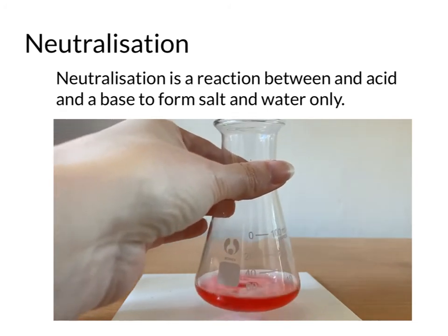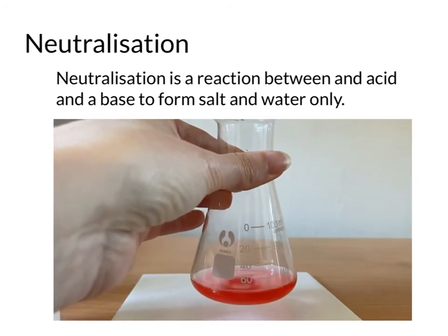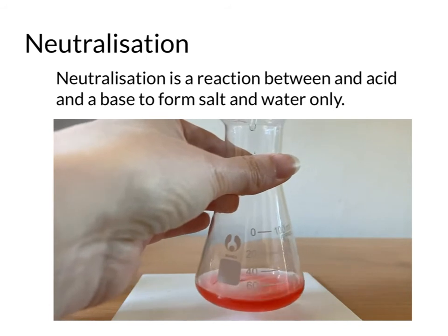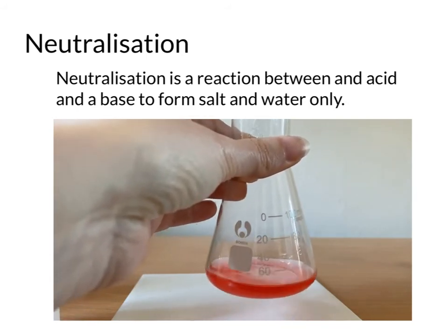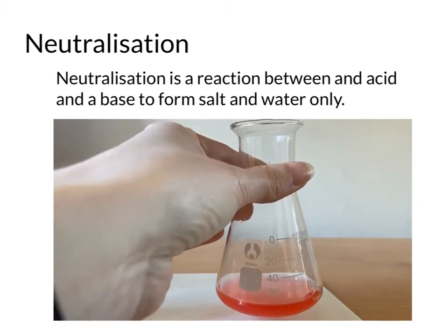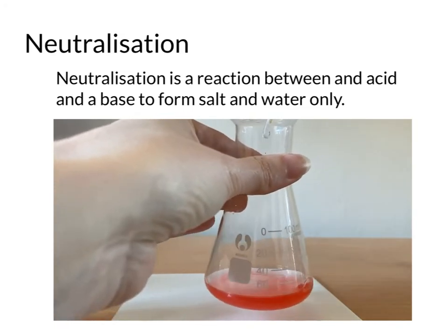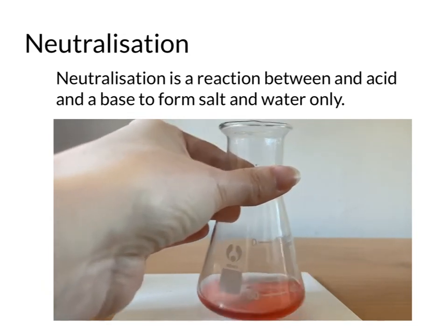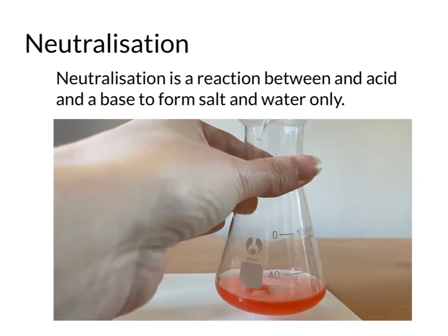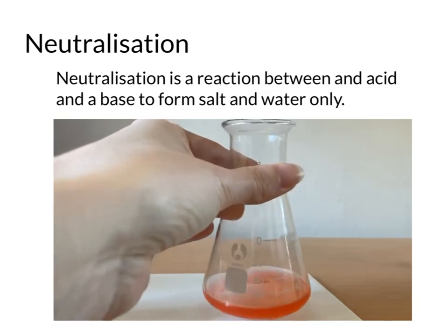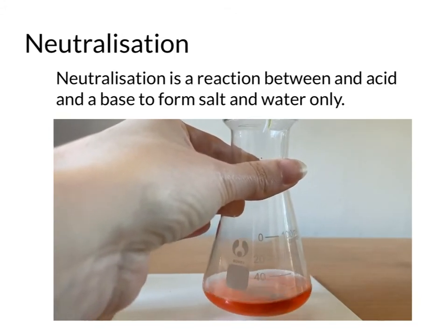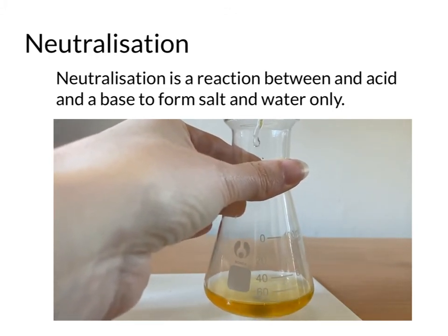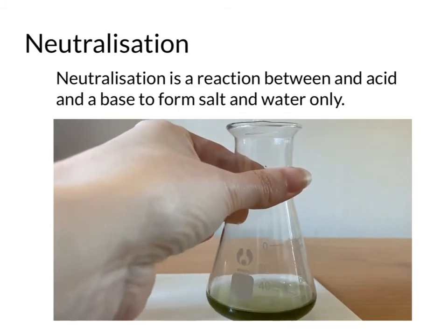You can see the sodium hydroxide being added. You can see slightly dark patches in the universal indicator. Then when I swirl it, it mixes in. It takes a long time for that pH to change, for it to change to be neutral, and slowly the pH starts to creep up, just a little bit at a time. It turns slightly more orange, then yellow. Two drops and it becomes an alkali.